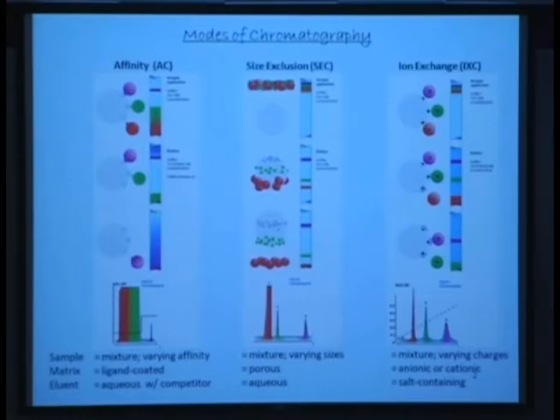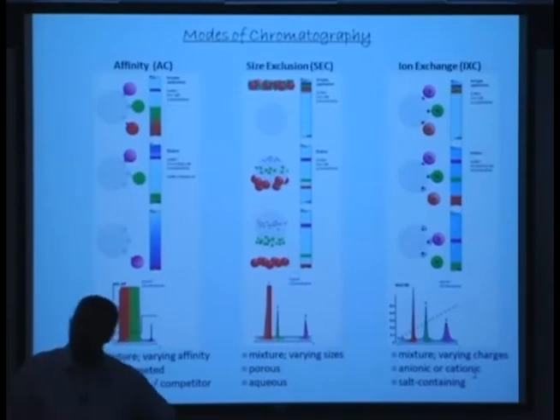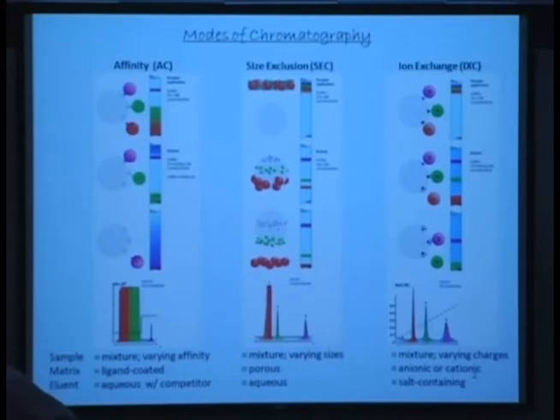Mass spectrometry obviously is typically very useful in this. Now if there are several types of molecules, for example, as we have seen that mannose is a component in several N-glycans, or galactose is a component in several N-glycans. Some have sialic acid, some don't have sialic acid. You might have a varying number of sialic acid residues. Then the affinity would change. So you would then have multiple peaks that might arise.